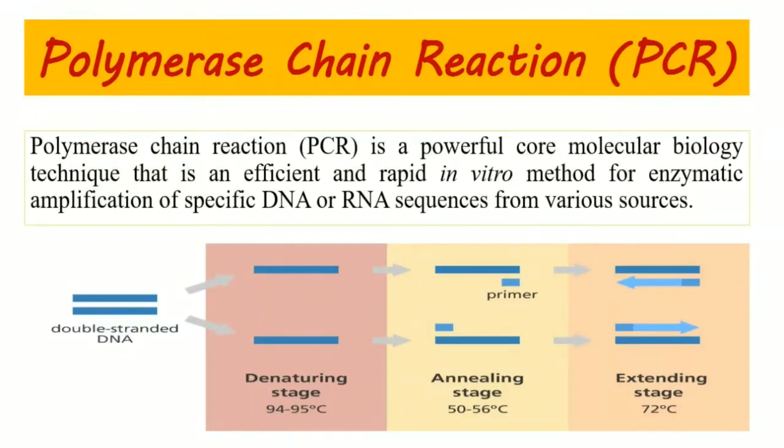In this video, we will talk about the types of polymerase chain reaction. So first of all, you should know what a polymerase chain reaction is. Polymerase chain reaction is a basic molecular biology technique that is used to amplify DNA and RNA sequences.